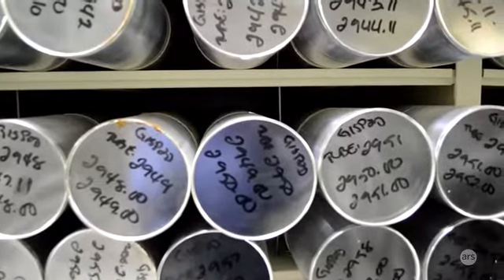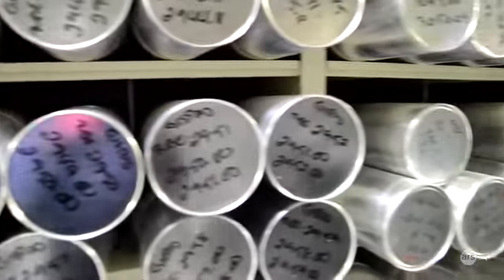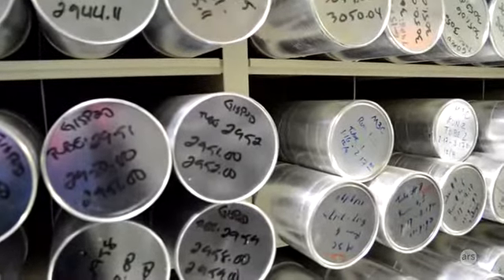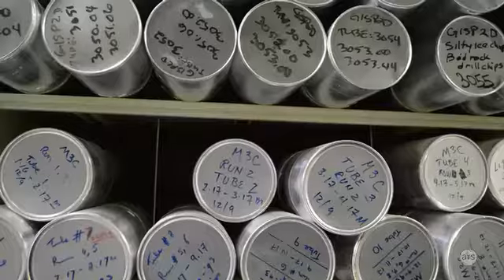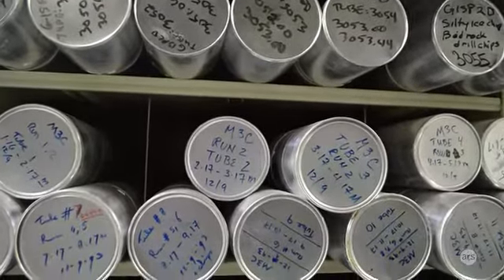So we look at ultra trace chemicals. That infers what the dust was, the chemistry of the dust, and how that changes over time, both the amount and the chemistry of it. And from that you can get ideas about wind patterns going back through time.